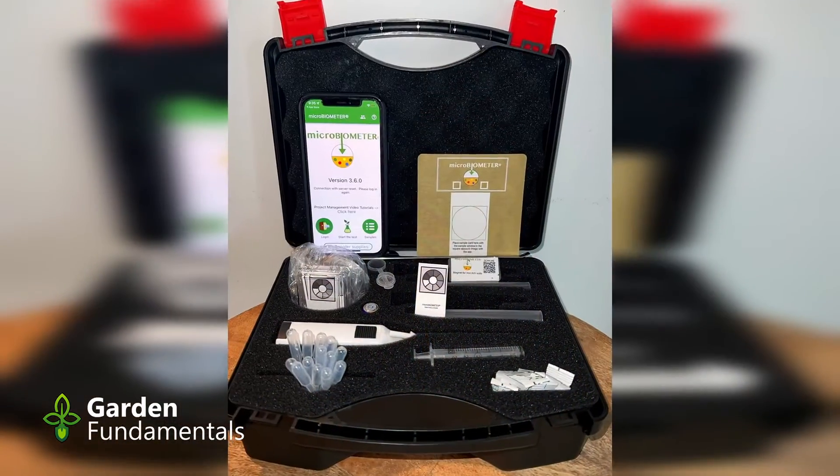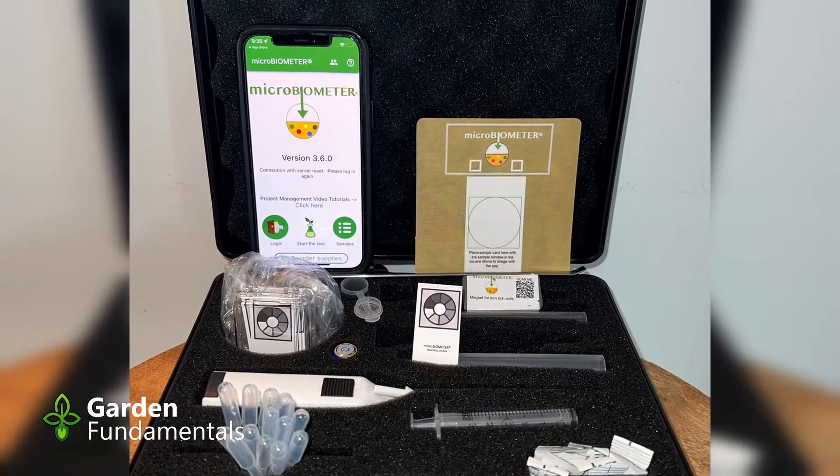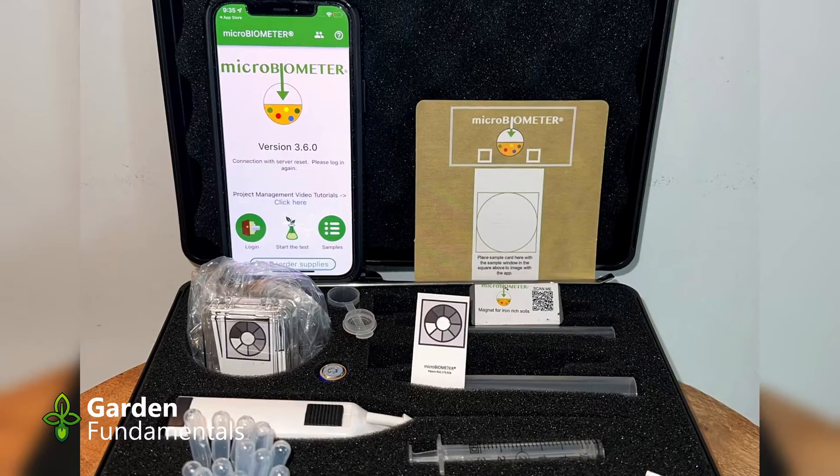but they're very expensive and they take several weeks. It's not really an answer for the average gardener. But there is now a new method designed specifically for measuring microbes in soil, compost, and compost tea. In this video I'm going to have a close look at how well this test works.